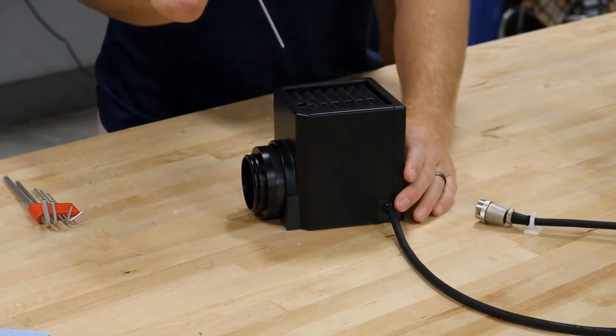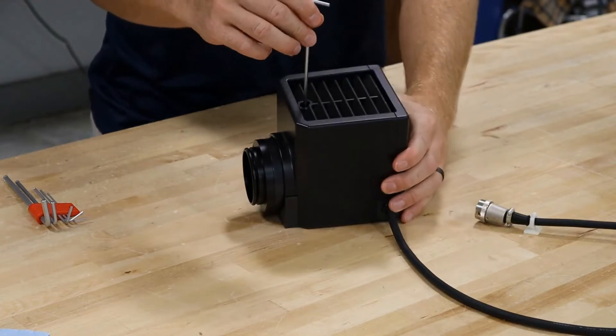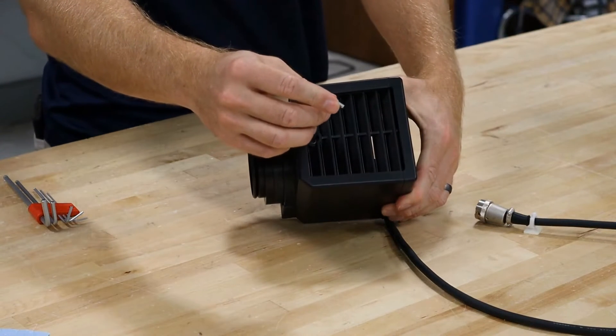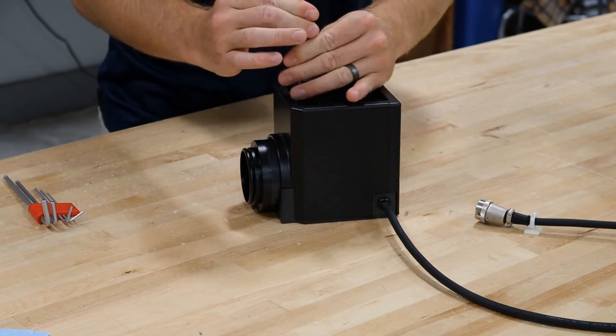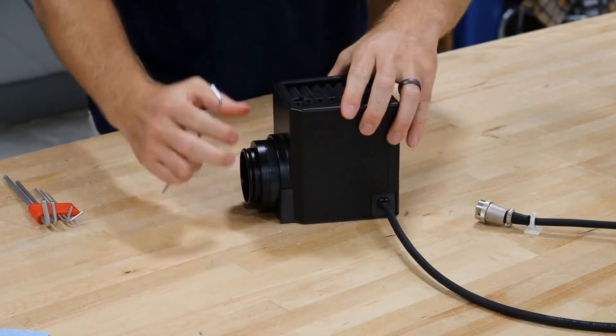Now that we've got our lamp house removed, we're going to switch over to Chad and he's going to show you how to change the bulb. Take your three millimeter wrench and loosen the small screw on the top of the lamp house. Give it a few turns and then you should be able to slide the top of the lamp house off.